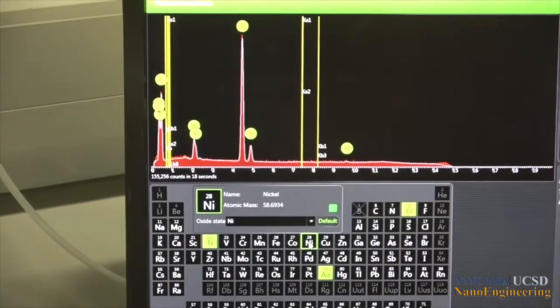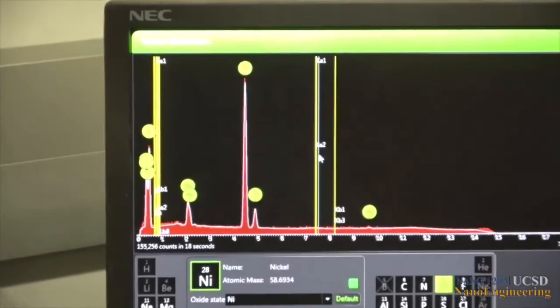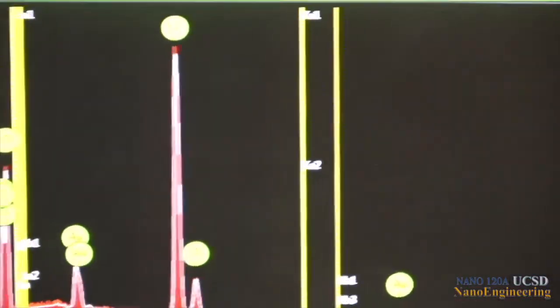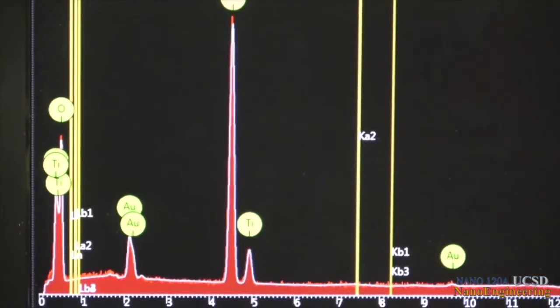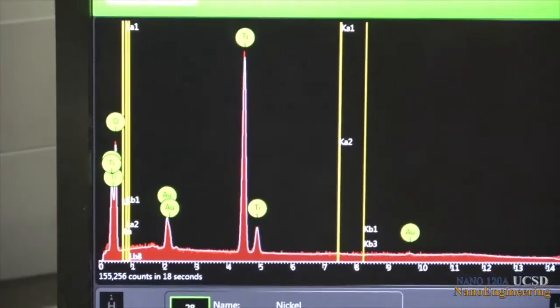Right clicking on the elemental box in the periodic table outlines the elemental box in green, and puts the X-ray lines—the K alpha, K beta, etc.—for that element on the spectrum to show where the various X-ray energies should exist for that element.